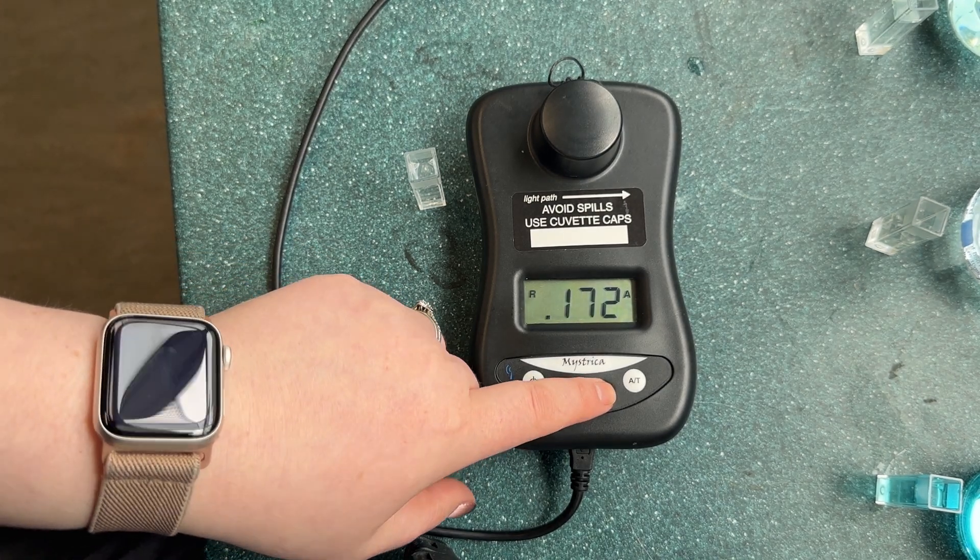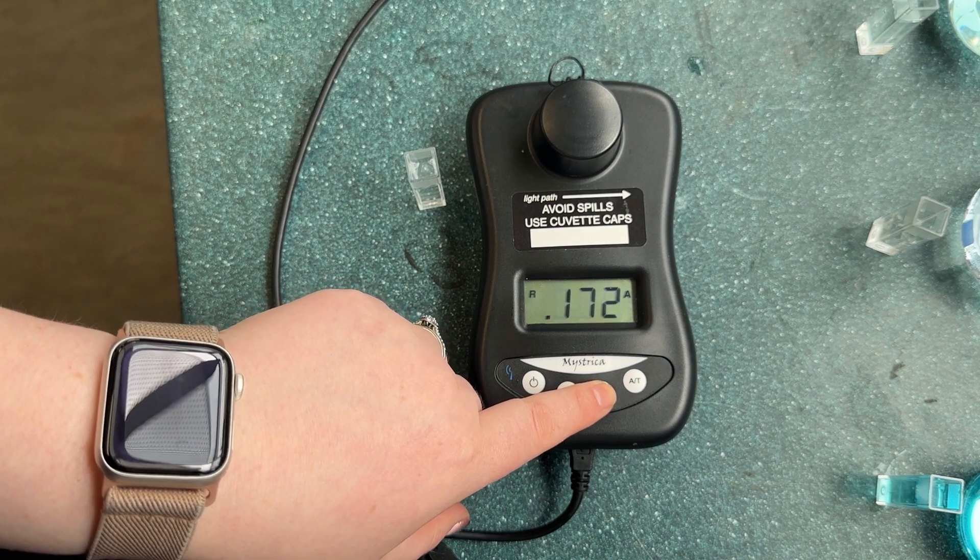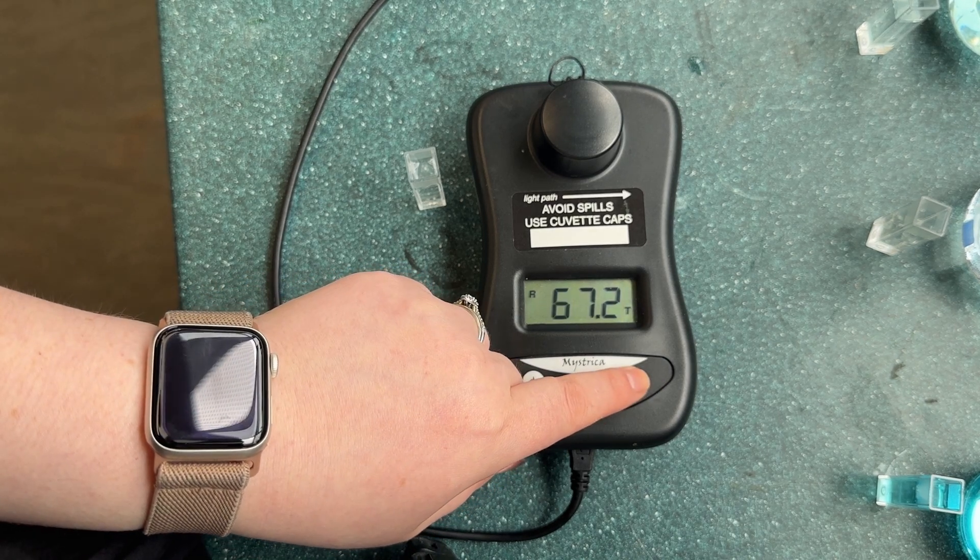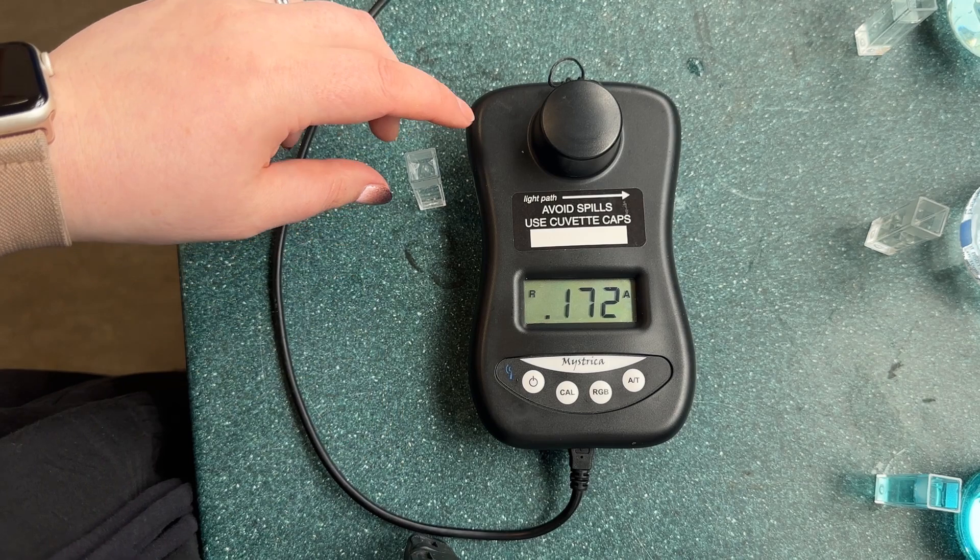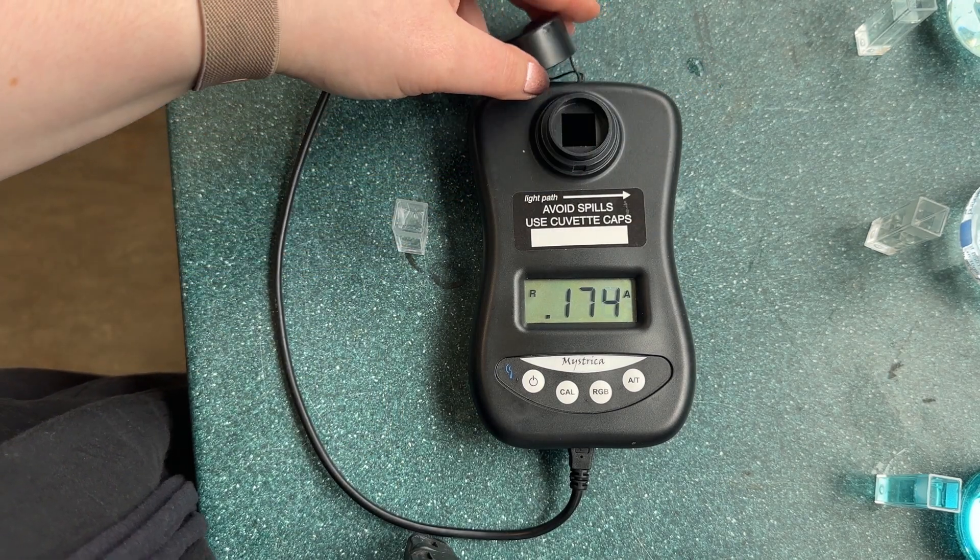We need to choose the color which is closest to the opposite on the color wheel. In this case we're going to use red. We have the option to measure either absorbance or transmittance. We're going to measure absorbance.